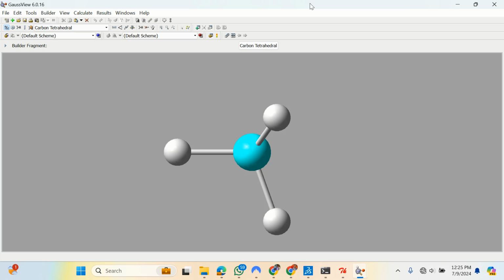Is that alright? Okay, so the next thing is to bring in our protein here, the cleaned one that has no ligand, only protein, right? Because we are looking for arginine 120 NE in our protein, not in our ligand. So we bring only protein here.